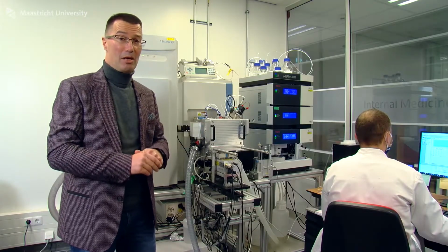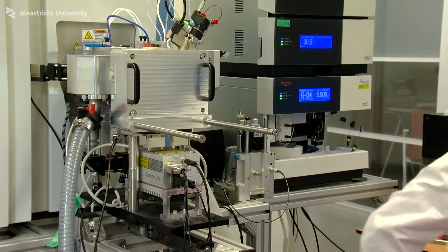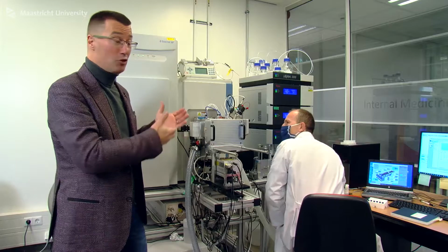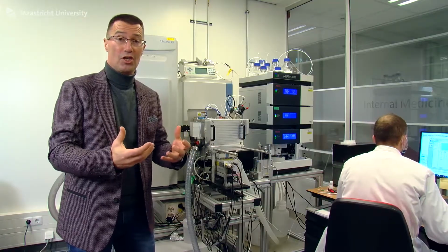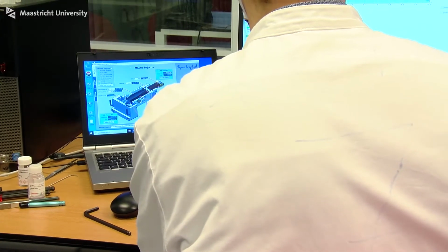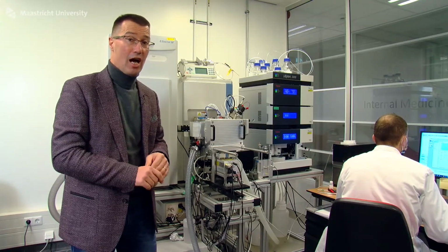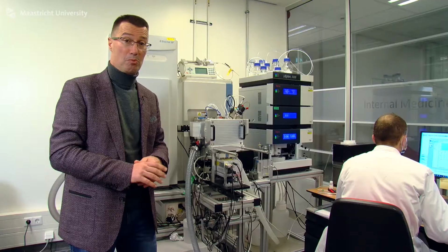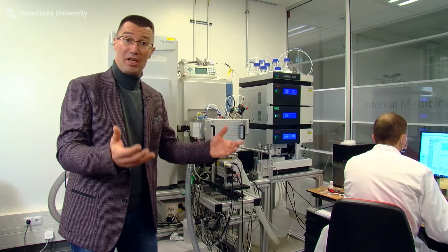So what makes us unique here at M4I is that we work with modern mass spectrometers, but sometimes they do not do what we wanted to do. So we need to do some engineering. And together with the instrument manufacturers and our engineering department here, we actually build new sources. One of the things that we are very good at is imaging. So they often ask us help to modify their instruments, or sometimes we have ideas how to improve the performance of modern mass spectrometers. So for instance here, a new multi-source that helps us to do even more accurate high-resolution molecular imaging with high-resolution mass spectrometry, really allowing us to unravel more spatial detail of our patients' biopsies.